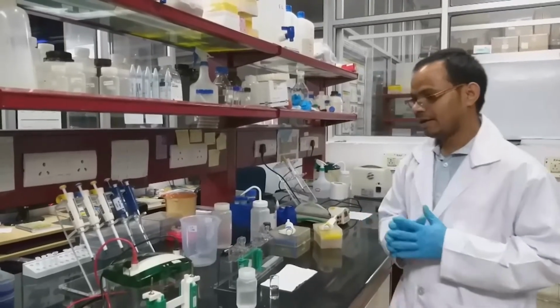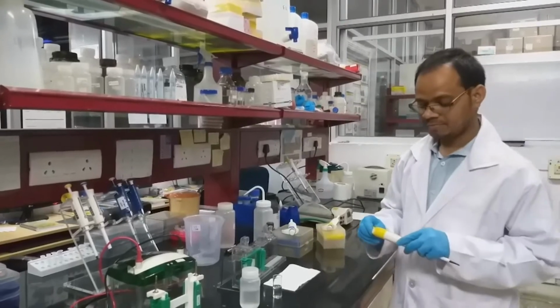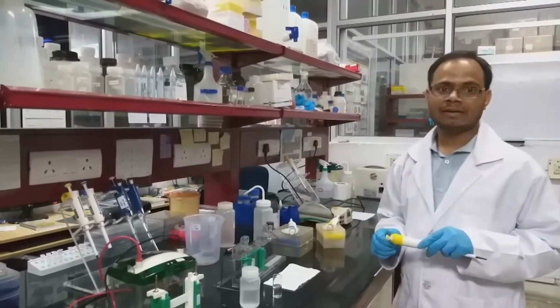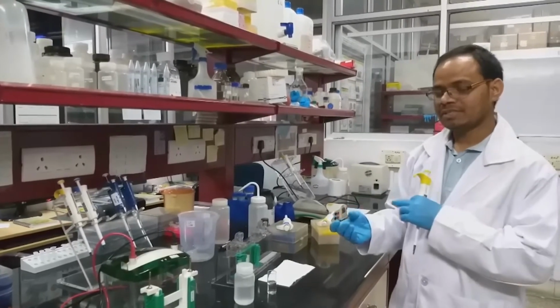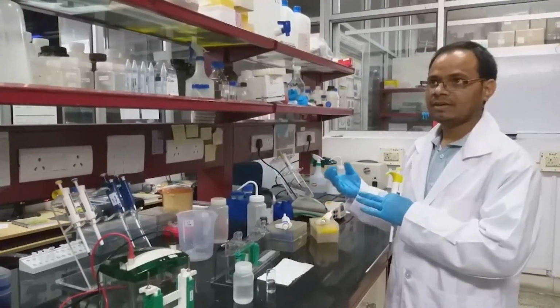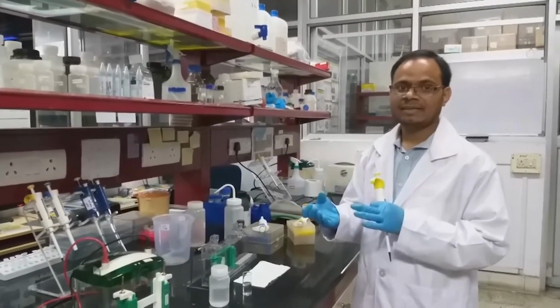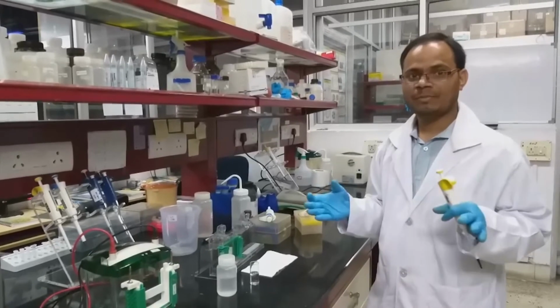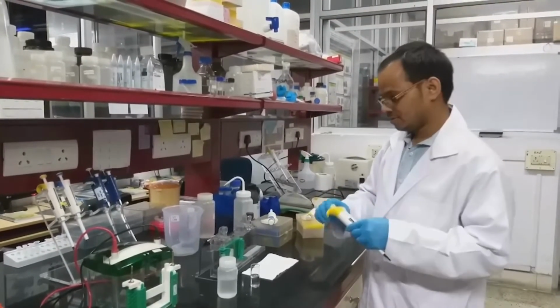So I'm going to add 5 microliter of this TEMED, which catalyzes the ammonium persulfate. Ammonium persulfate in turn provides free radical species, and free radical species accelerate the polymerization. This is the overall principle of this resolving gel. So I will add TEMED.